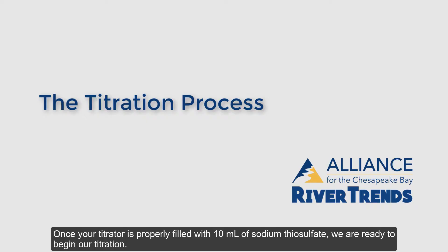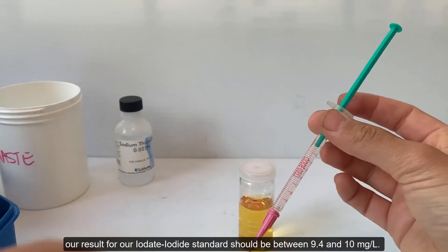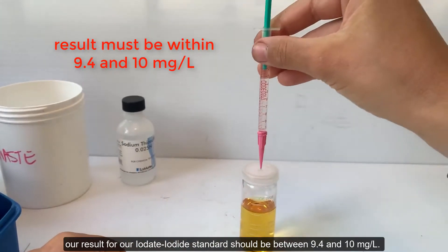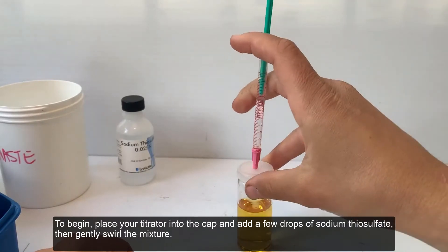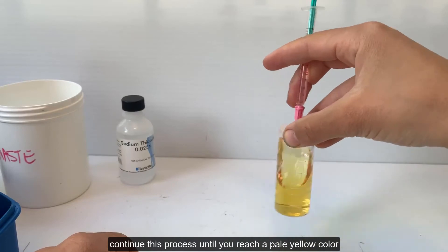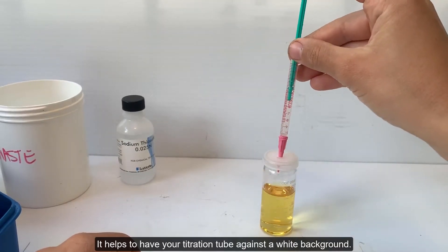Once your titrator is properly filled with 10 ml of sodium thiosulfate, we are ready to begin our titration. To know that the sodium thiosulfate is functioning properly, our results for our iodate-iodide standard should be between 9.4 and 10 mg per liter. To begin, place your titrator in the cap and add a few drops of sodium thiosulfate, then gently swirl the mixture. Continue this process until you reach a pale yellow color. It helps to have your titration tube against a white background.